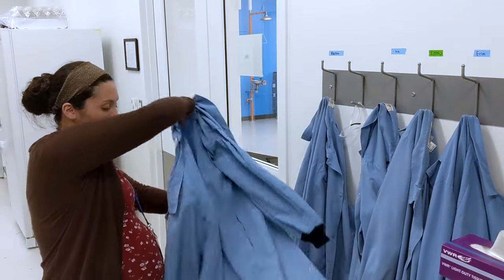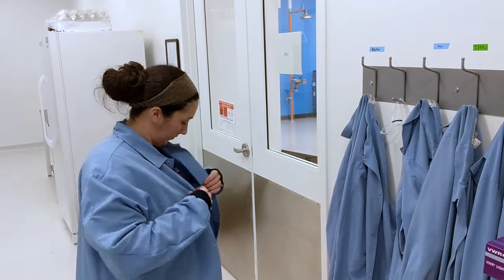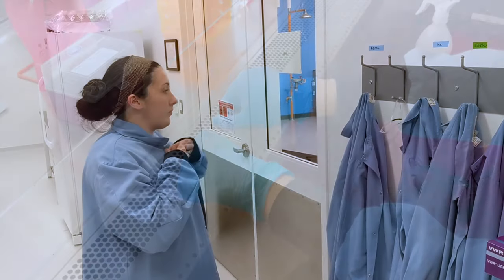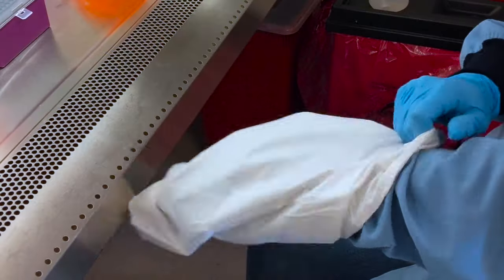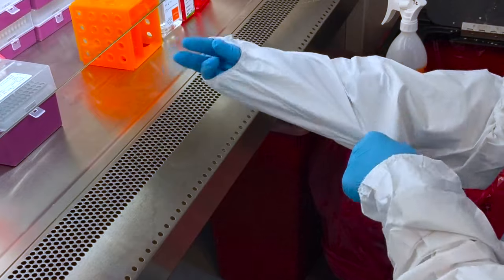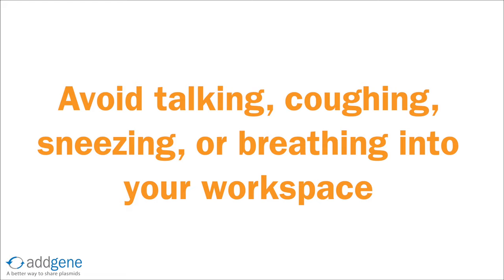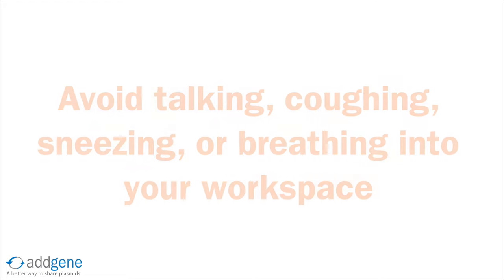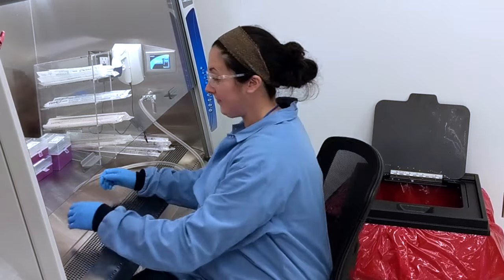Body flora are a main source of tissue culture contamination. To prevent unwanted contamination, wear a clean lab coat and gloves when working in a hood. Before entering the biosafety cabinet, check your lab coat to ensure that your wrists and arms are completely covered. If you find that skin becomes exposed while working, wear disposable sleeves. In addition, avoid talking, coughing, sneezing, or breathing around your workspace by turning to the side or coughing and sneezing into your shoulder or upper arm.